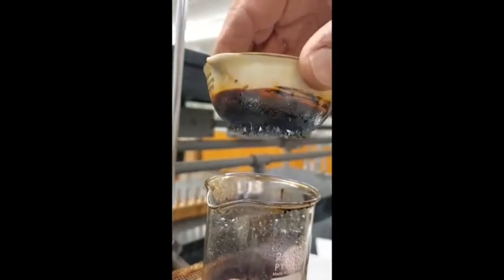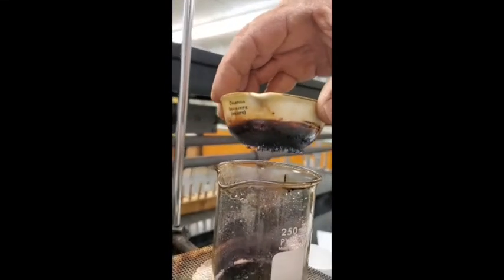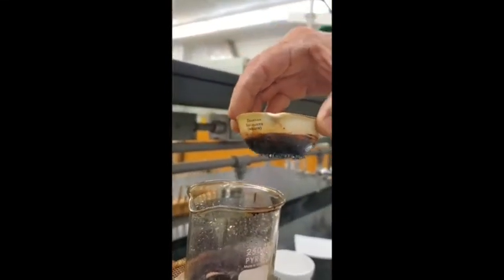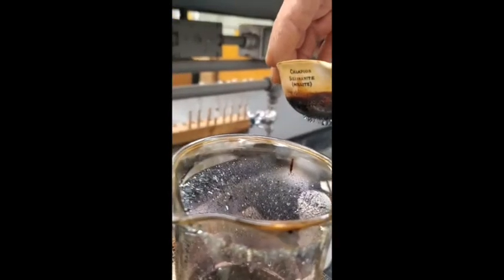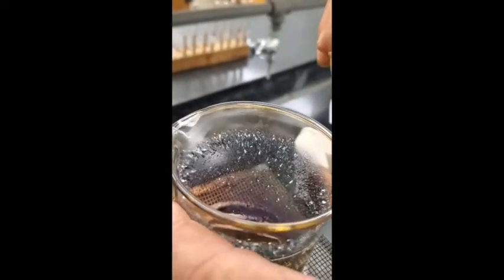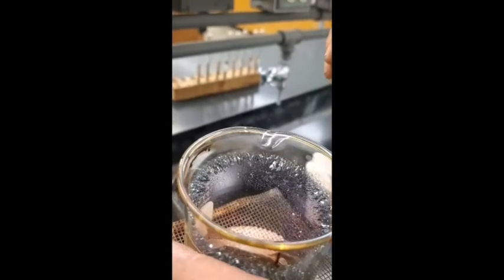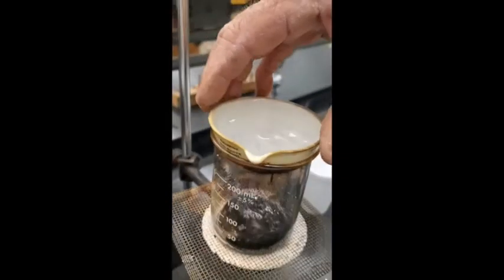Yep, that is something else, isn't it? They're absolutely pure iodine crystals. There's some on the inside of the beaker too. Look at those. Isn't that pretty? Let me rotate this and you can see the crystals shining. Boy, that is something. Yeah, that's a good experiment.